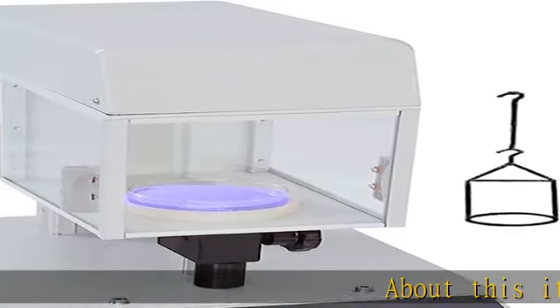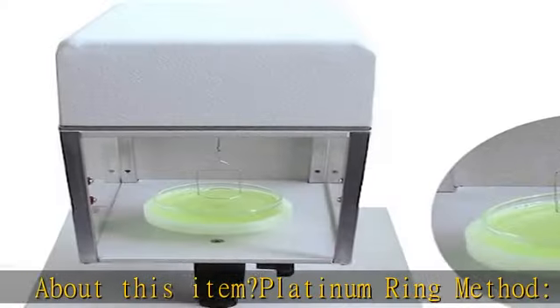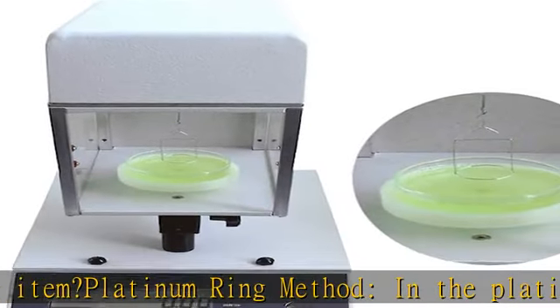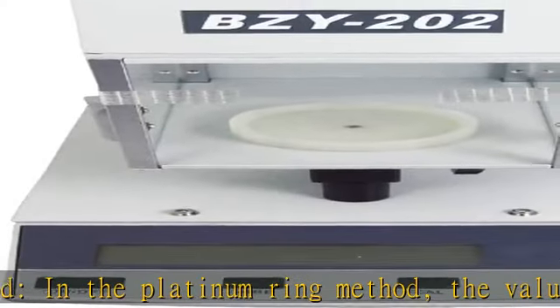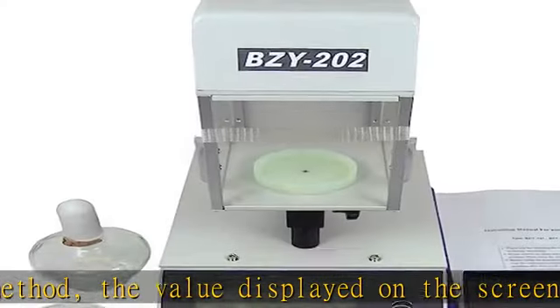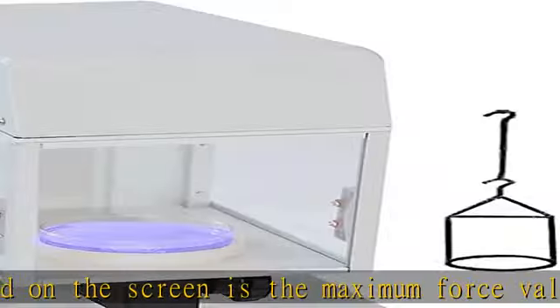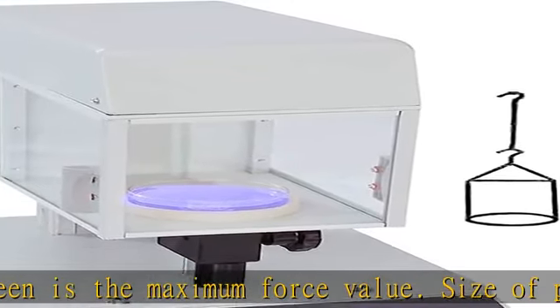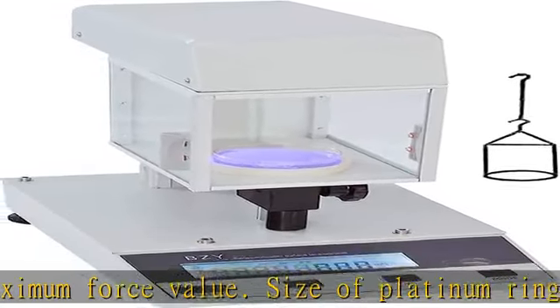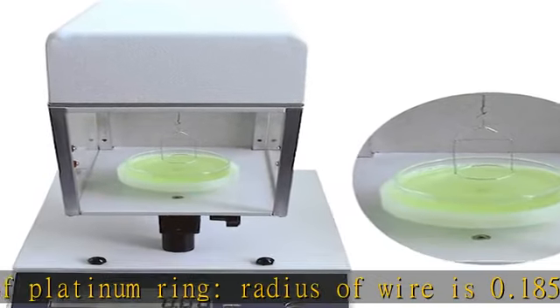About this item: platinum ring method. In the platinum ring method, the value displayed on the screen is the maximum force value. Size of platinum ring: radius of wire is 0.185 millimeters, radius of ring is 9.55 millimeters, perimeter of ring is 60 millimeters. Measuring range: 0–400 mN/m, suitable for measuring liquid containing surfactant or volatile substance.